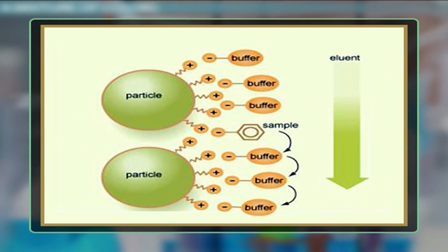The salt mixture can itself be a buffer, or a separate buffer can be added to the eluent if required. The competing ions, which have the function of eluting sample components through the column within reasonable time, are the essential component of the eluent.